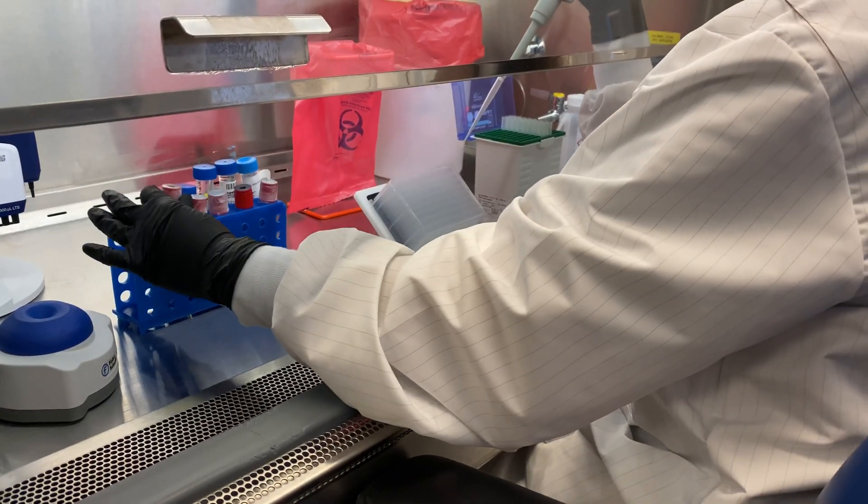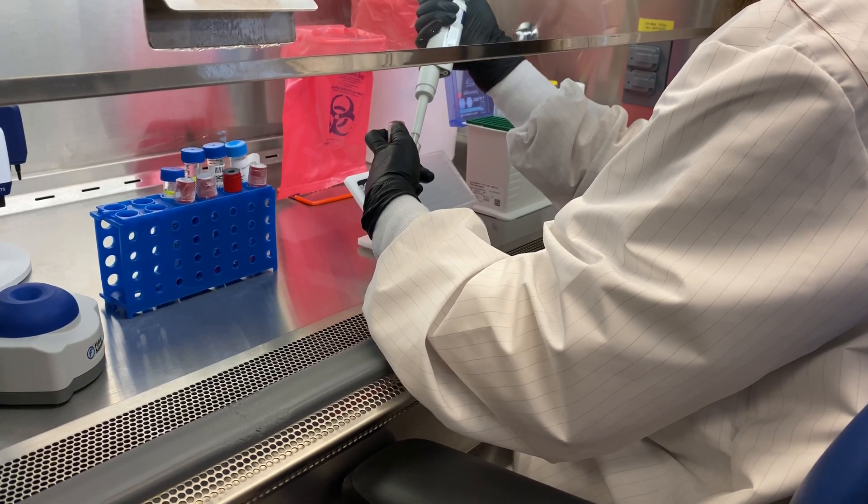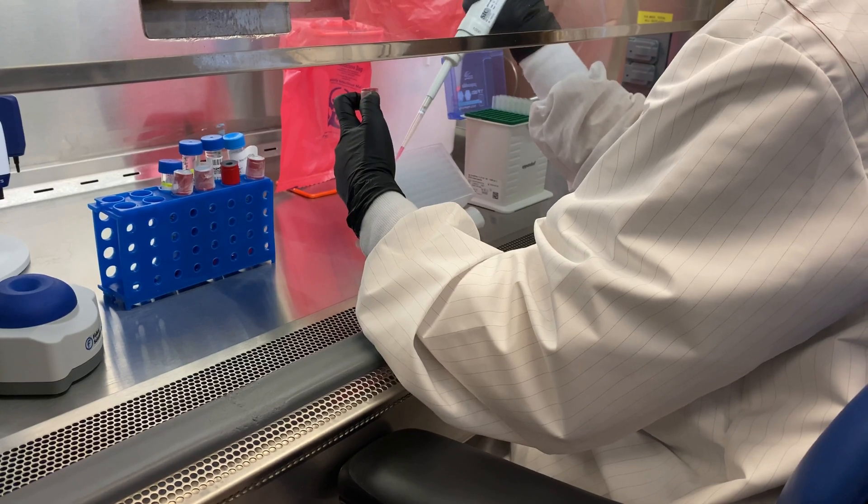Next is the addition of 200 microliters of patient sample. Vortex the sample before pipetting. Note that extended pipette tips may be required to reach the specimen.